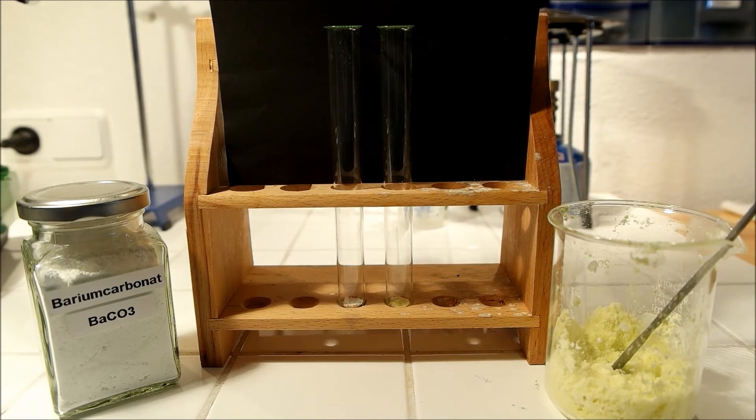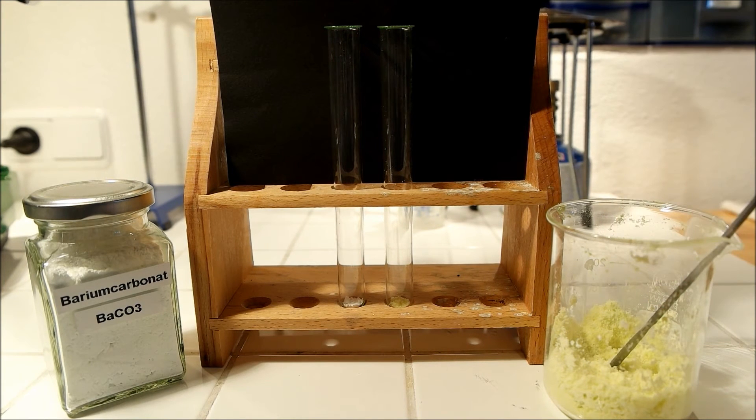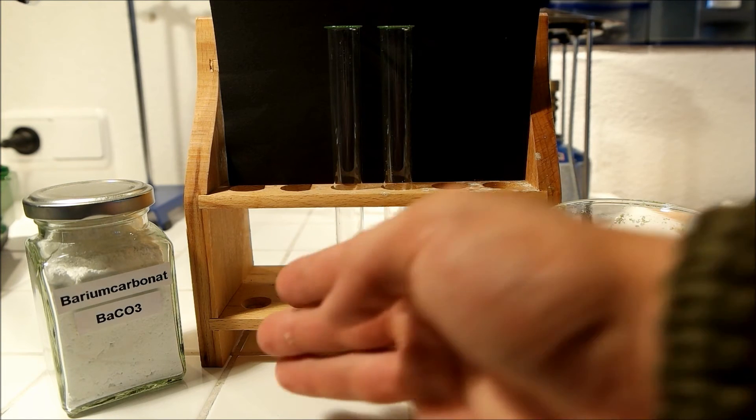Now I want to show you that the physical properties of the two salts, barium carbonate and barium chloride, are very different. Both salts have the same cation, which is barium, but the anion is different. Here it's carbonate, here it's chloride.